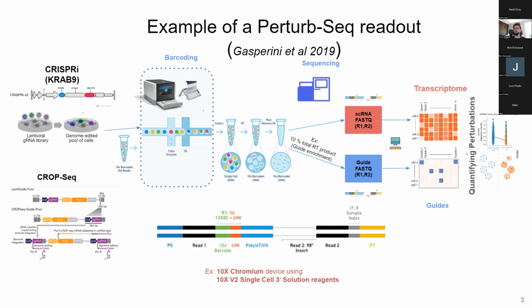In the end, you need to take a specific guide and check which genes are affected by the depletion of a given enhancer. So you have the task of differential perturbation quantification, and we can use different tools to try to solve it.